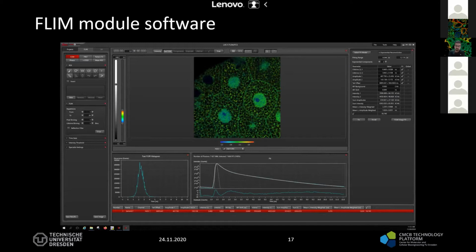There's nothing calculated. Another way is that you have your photons and you know how long it takes for them to reach your detector. So you have all this temporal information, and you do a fast 3-component fitting to your data. I don't really know the details of the algorithm. Usually it's not discussed with the customers, but as far as I know, this is how it's done. So it would be a 3-component decay fit, very fast, just to visualize a fast FLIM image.